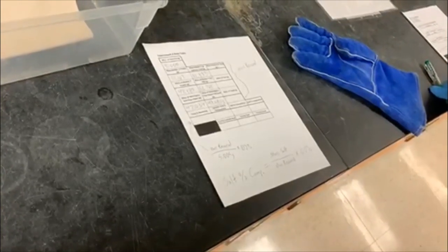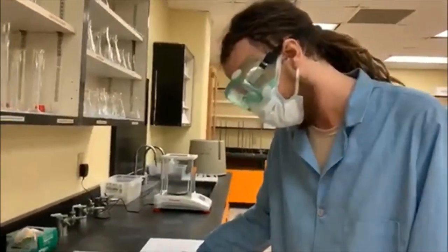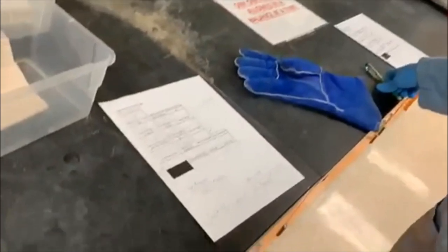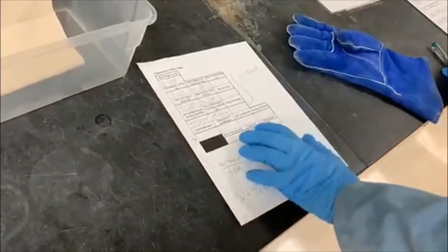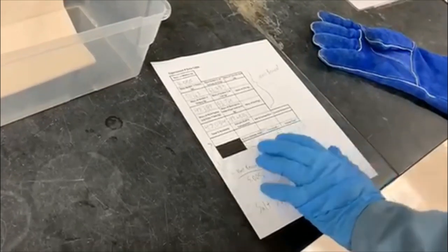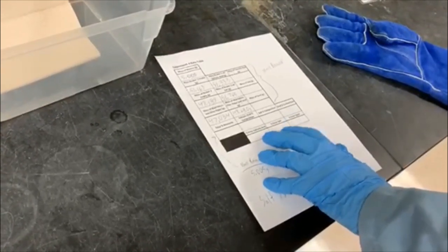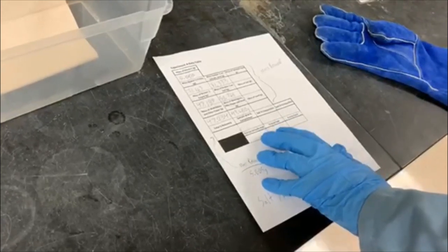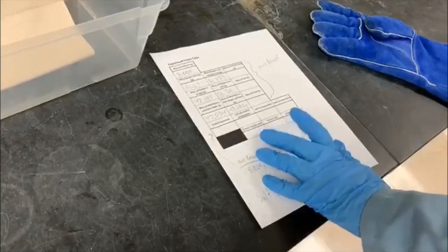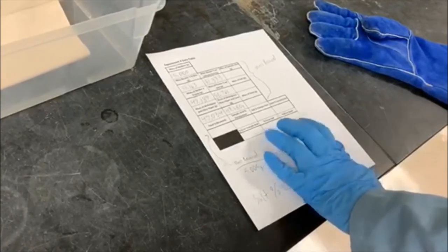Okay. And that should be all you need for this experiment. Oh, and you'll compare the compositions you get from this experiment to the actual compositions that the lab has to get your percent error for your sand, salt, and salicylic acid.